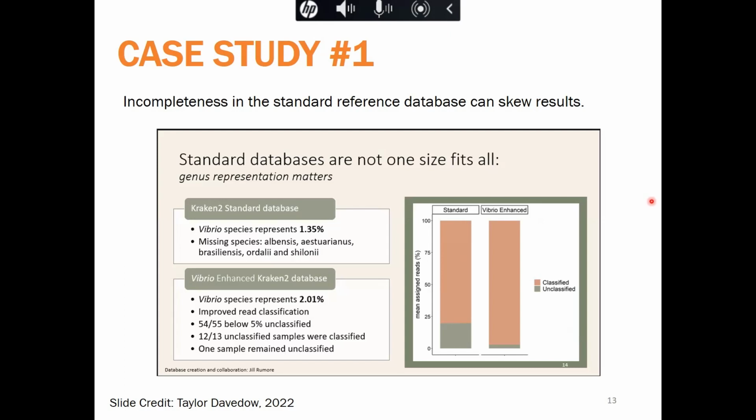Now, when using the pre-computed reference database that was distributed with the Kraken 2 classification software, about 75% of the reads were being classified, meaning that around 25% were not. Initially, we thought these samples may have been contaminated, as anything more than 10% unclassified for sequence data that should have originated from a single isolate is quite high.